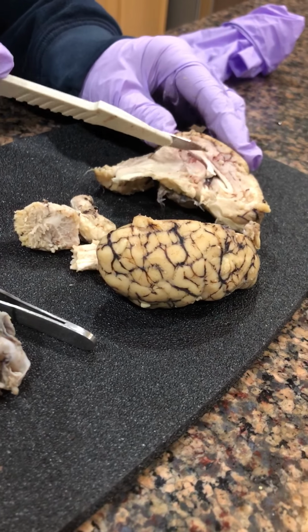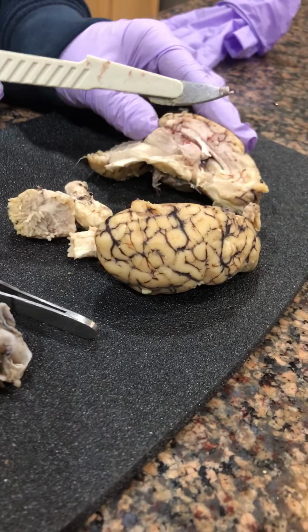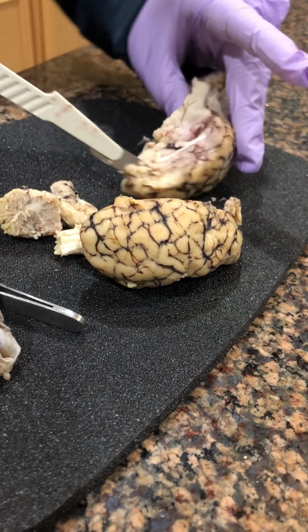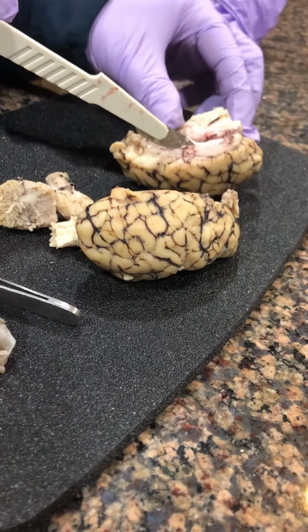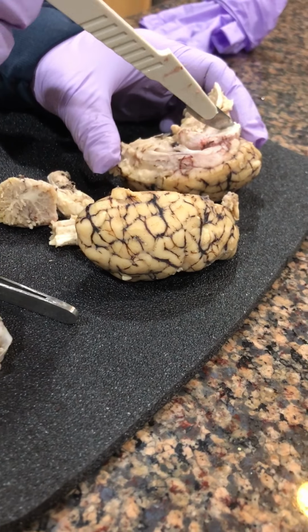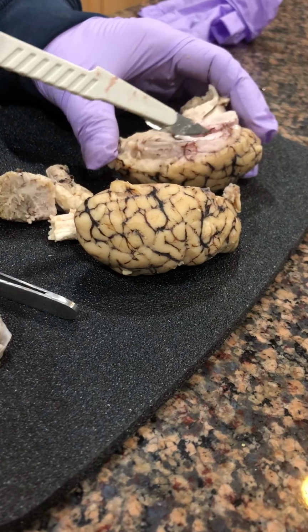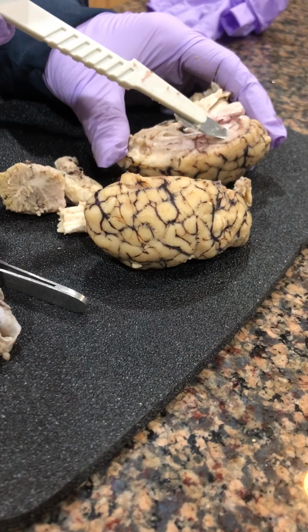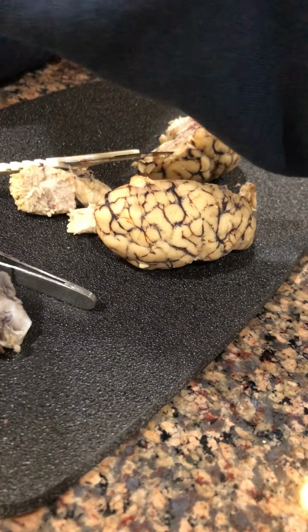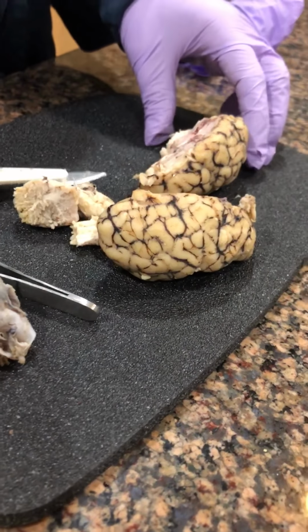Should be more round. And the optic chiasma area is, let me turn him this way and do it. The chiasma will be this right here. And the corpus callosum is this area right up here on top. I think that is all of it. That is it. Thank you.